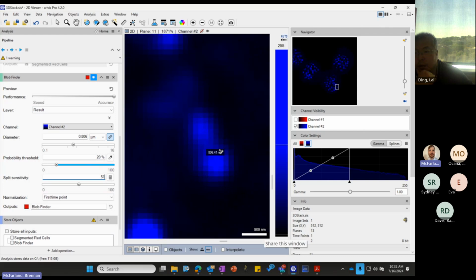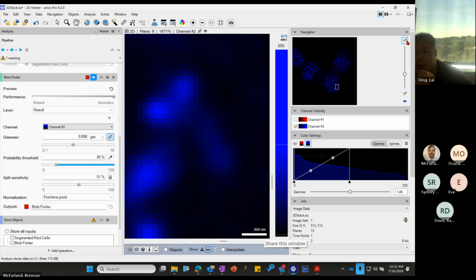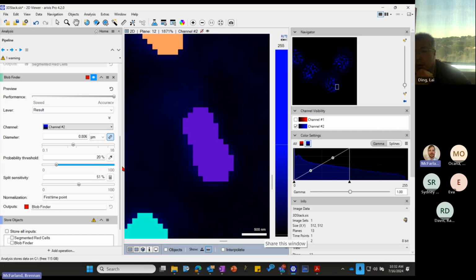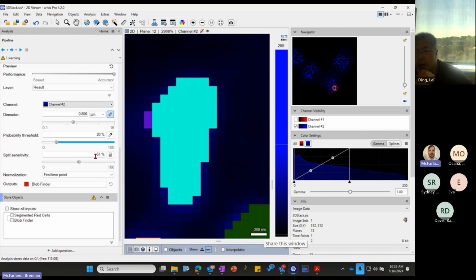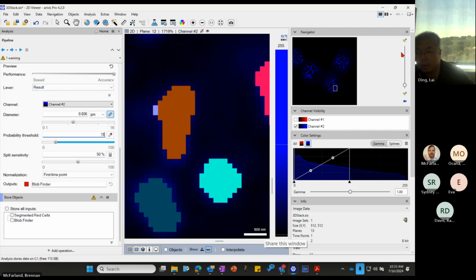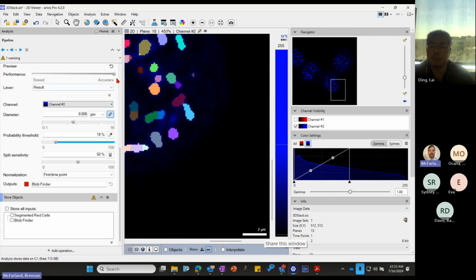The important thing is, maybe if I wanted to split these, maybe we can look in. Looks like we probably would keep these together. Okay. Maybe something like that is good. 50%. I have to reduce this because there's another object there. Okay. So we'll run this.